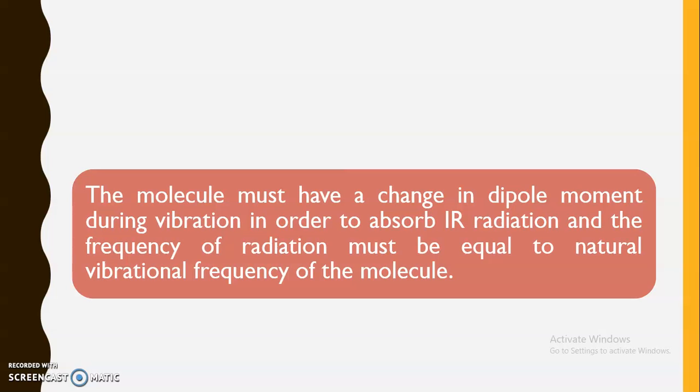The molecule must have a change in the dipole moment during the vibration in order to absorb the IR radiations. And the frequency of radiation must be equal to the natural vibrational frequency of the molecule. Those molecules which show a dipole moment only absorb the infrared radiations. As I said, chlorine and bromine, these diatomic molecules, do not absorb the IR radiations because they do not show any dipole moment. Now what is the meaning of dipole moment?